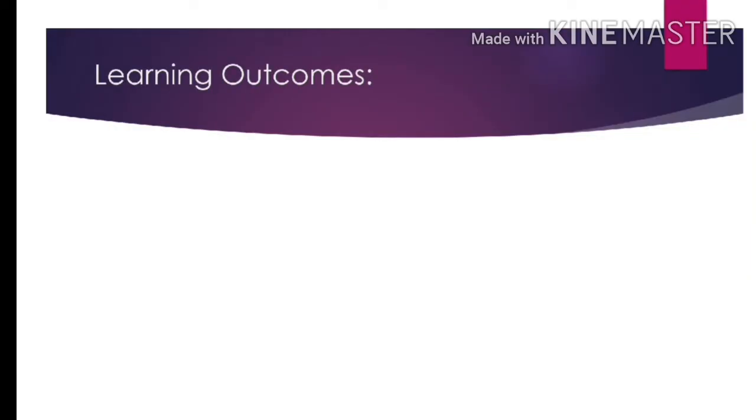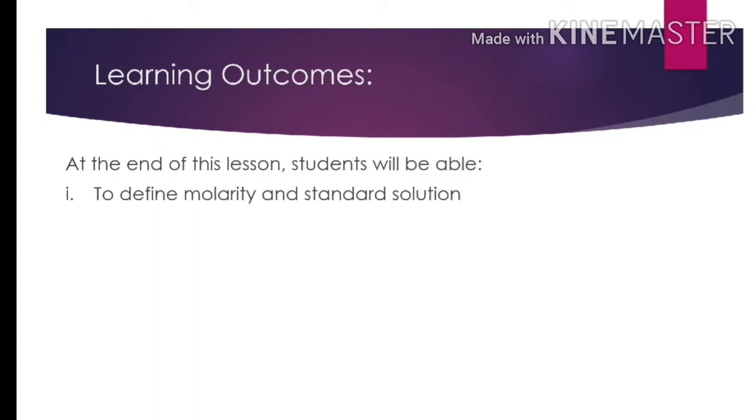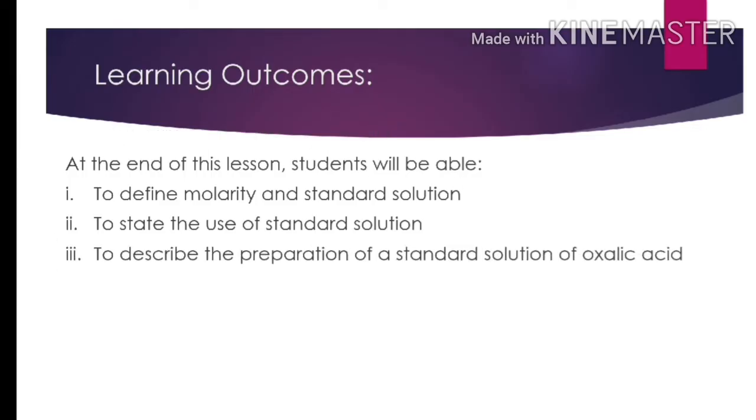The learning outcomes are: at the end of this lesson, you should be able to: number 1, to define molarity and standard solution. Number 2, to state the use of standard solution. Number 3, to describe the preparation of a standard solution of oxalic acid.